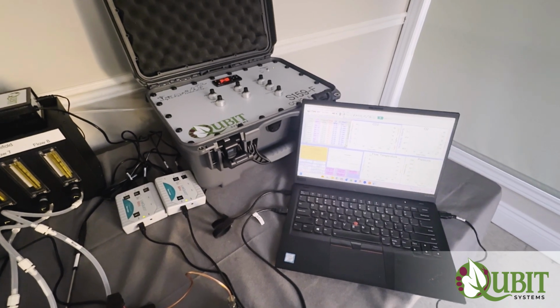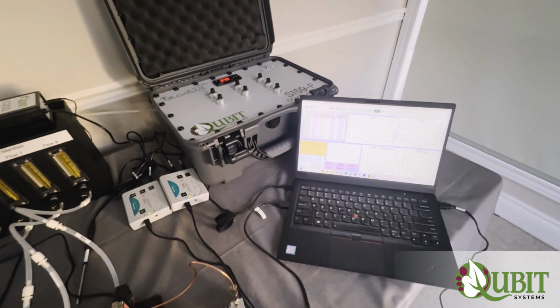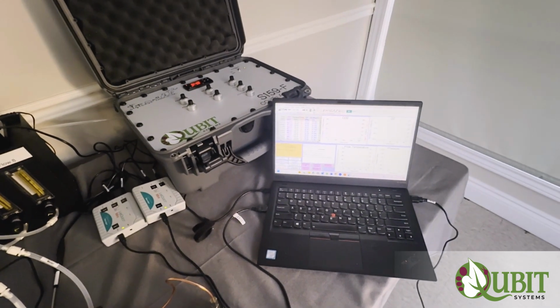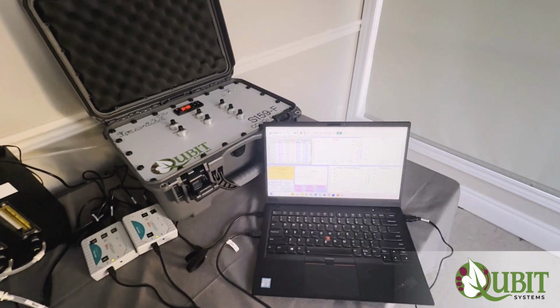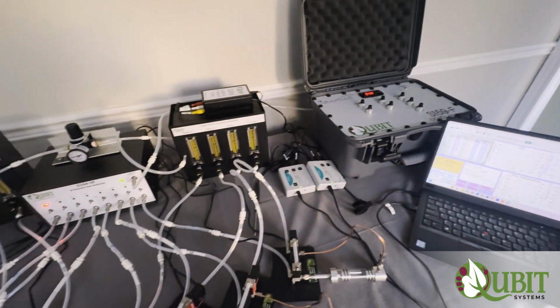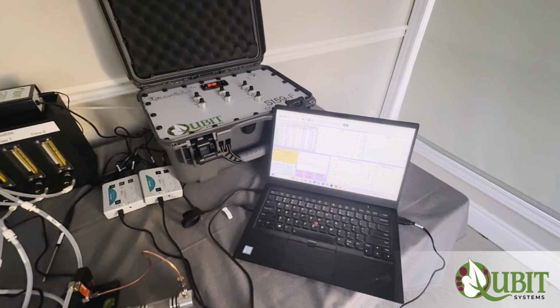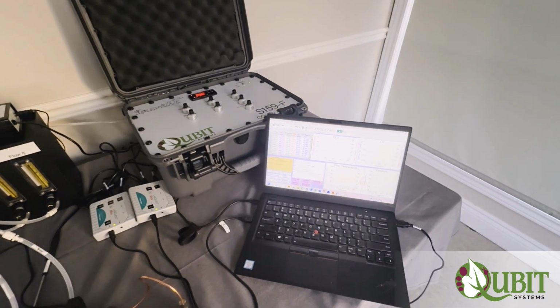So it's a really good idea to regularly save the data and make sure it is not lost in case there is a power outage and the computer shuts down or there's some other problem. You will lose the data if it's not saved.